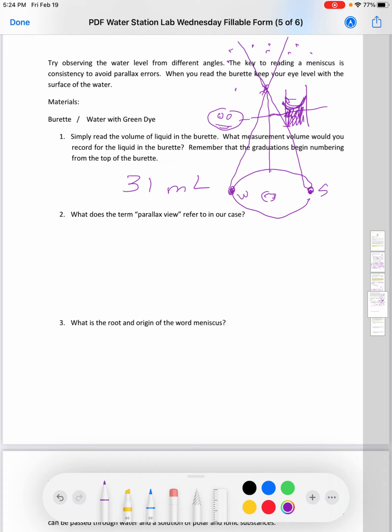And it's the same with this meniscus that we're reading, the curved surface of the water due to surface tension, due to adhesion of the water to the glass. And again, it's gravity that limits how far it will go. And of course, the strength of the hydrogen bonds to the substance we're adhering to. A plastic tube will have a slightly different meniscus than that, but if you look at our thermometers, they have a meniscus. If you look at a mercury thermometer, it actually kind of has a negative meniscus.